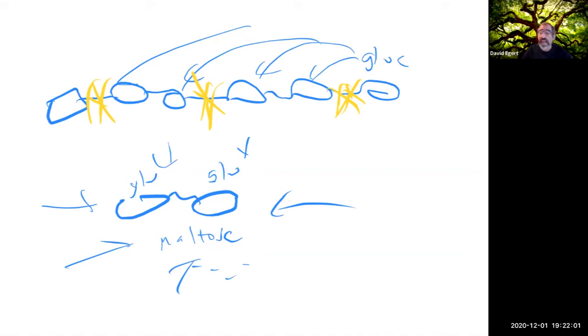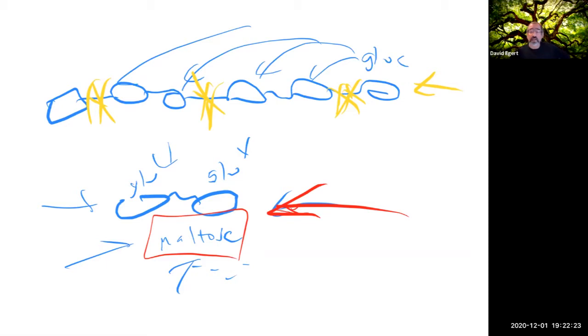So that's going to be my assay for the carbohydrates. I'll be able to both check to see is there still starch or is the starch gone? And I'll also be able to look for the products. Are there any products of digestion, this maltose, or is there no maltose? Right, so if there was no digestion at all, what would I expect? Again, there's the iodine versus Benedict's.